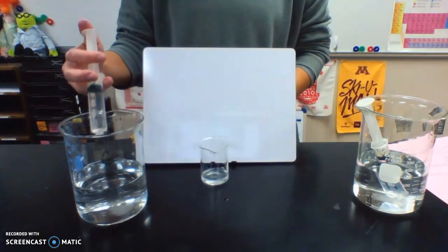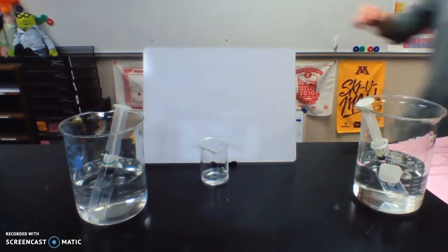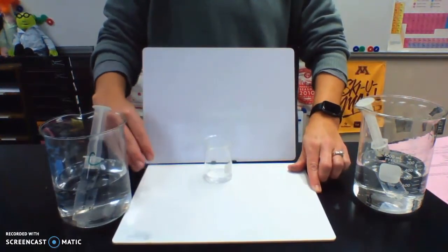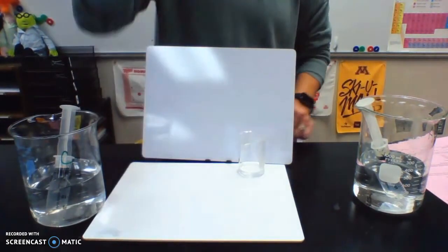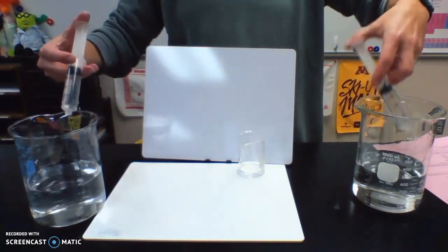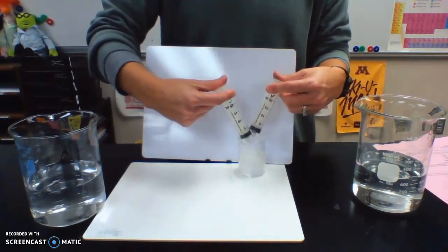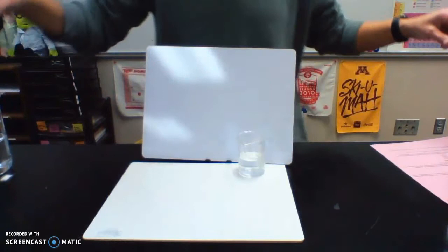All good plans until they're not. How about we try this also? Okay, let's see if that helps. Okay, here we go. Ready, set, start your stopwatch. I'm going to get the next solution ready while you're timing.